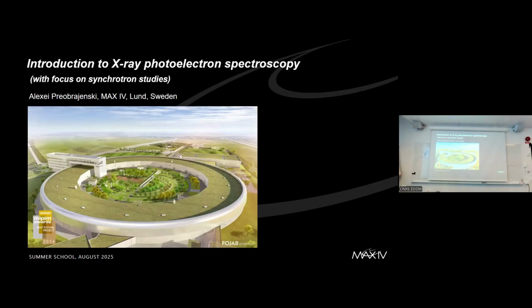Hi. My name is Alexei Preobrajenski. I work as a beamline scientist, beamline lead, at one of the spectroscopic beamlines at MAX IV, which is called FlexPES. And I will give you a brief introduction to X-ray photoelectron spectroscopy, specifically focused on the applications in synchrotron radiation. So what you cannot measure in the standard lab, but what you can measure at the synchrotron using XPS.